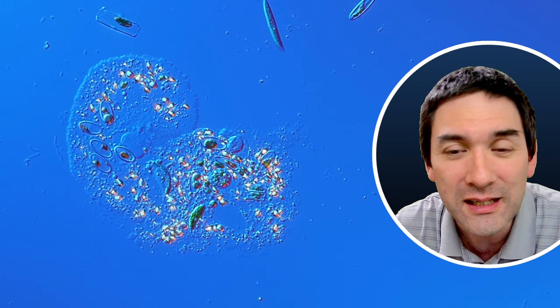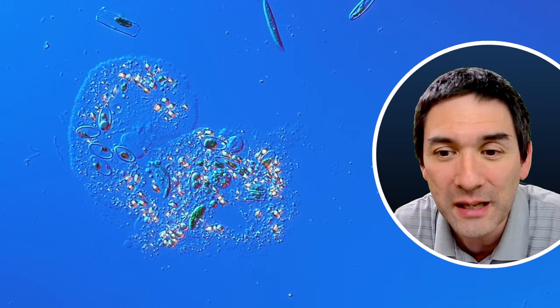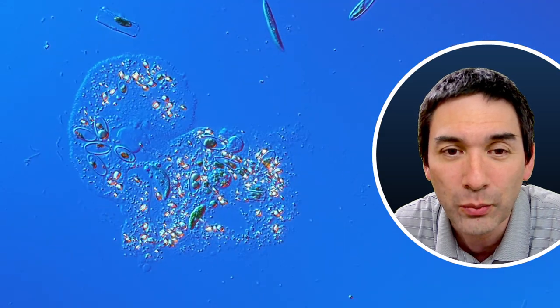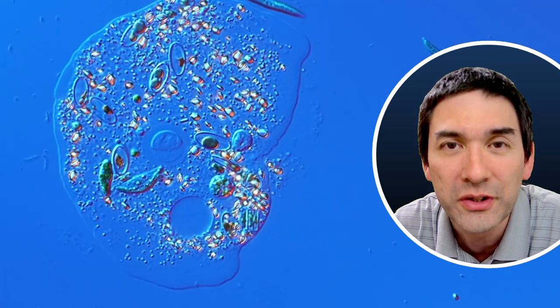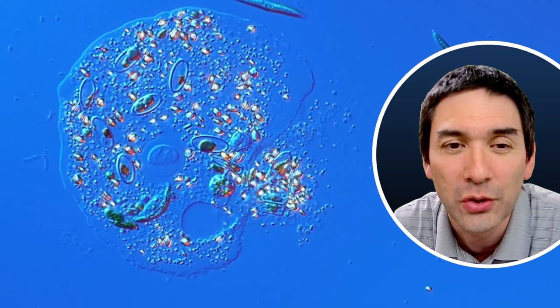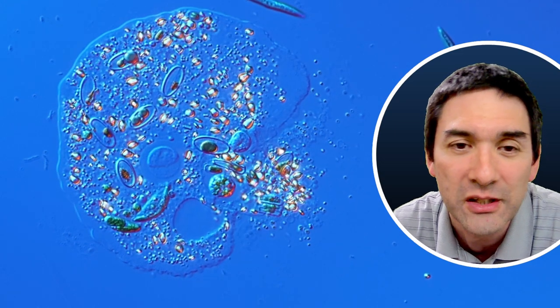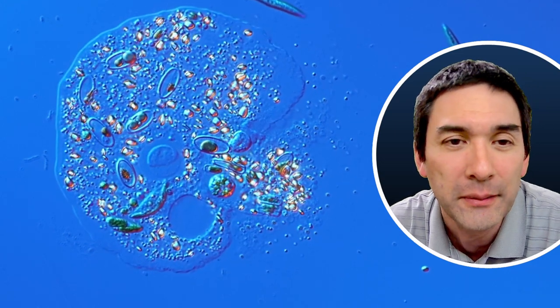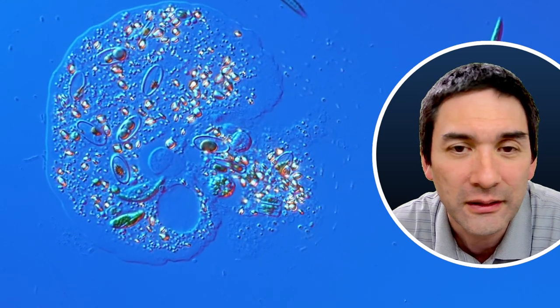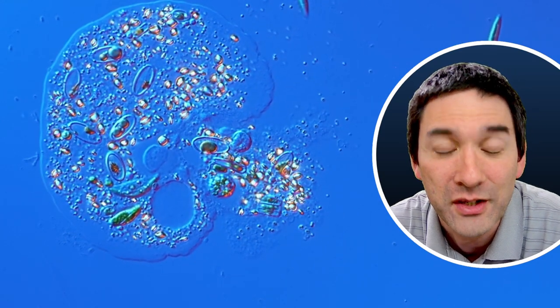One of the nice things here in this program is I'm able to move forwards and backwards here. So I'm going to show you here everything again, a little bit larger, how the cell pops open. And here we're able to also see a couple of other interesting structures, like for example, a nucleus, you might be able to see of the cell. And of course, a whole bunch of food vacuoles and a variety of other things as well.